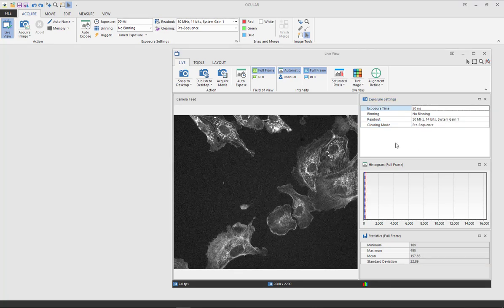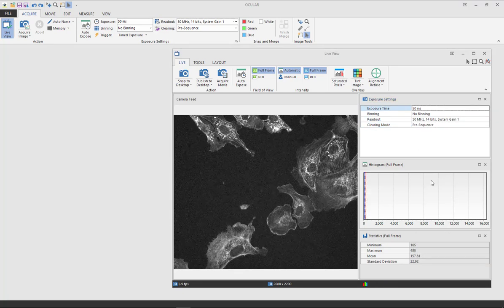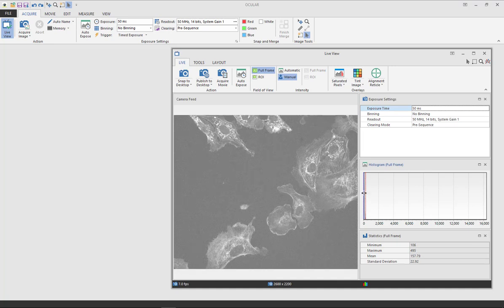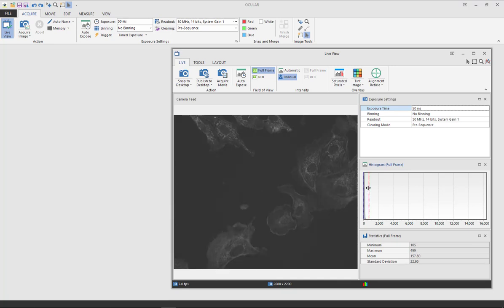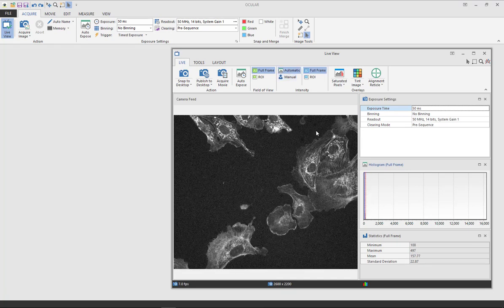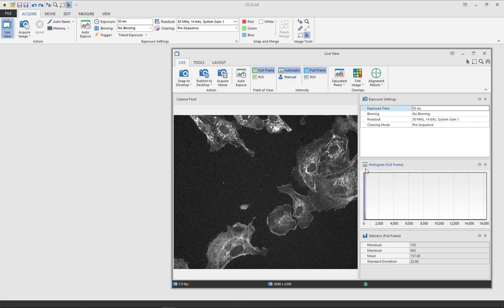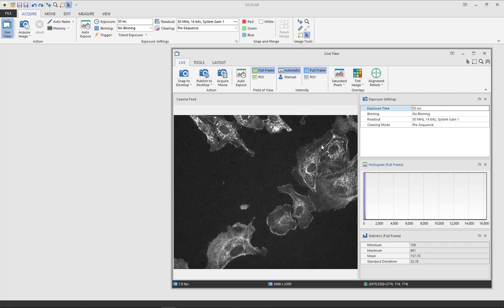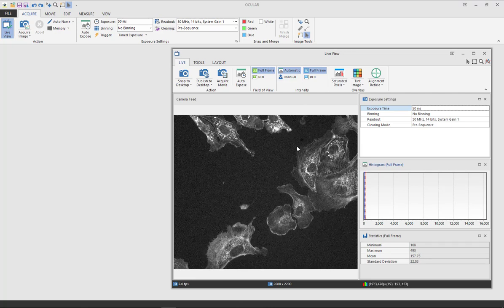Here you will also see the histogram where you can manually adjust the black values and the white values. I'm going to leave this as automatic so that the values will adjust automatically when I'm moving around my sample.